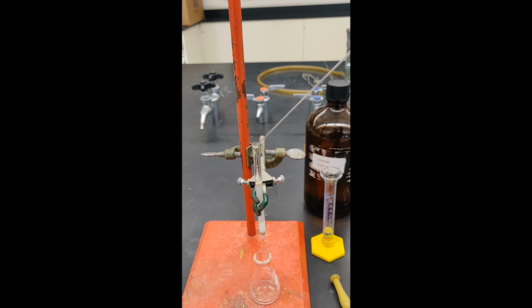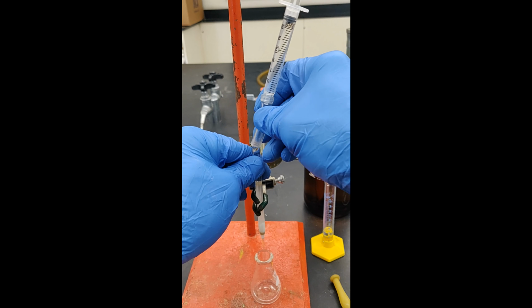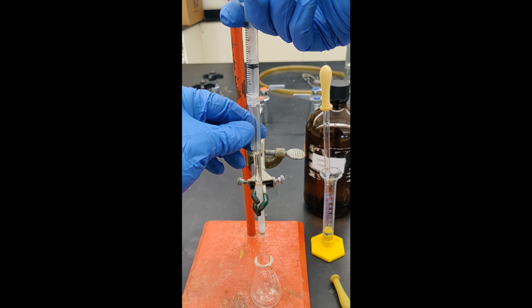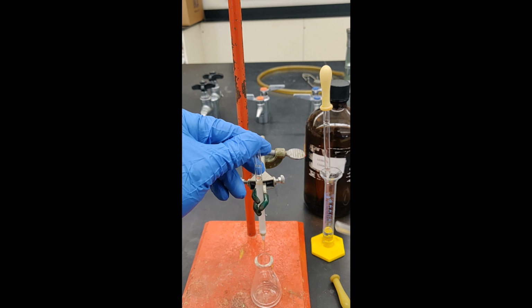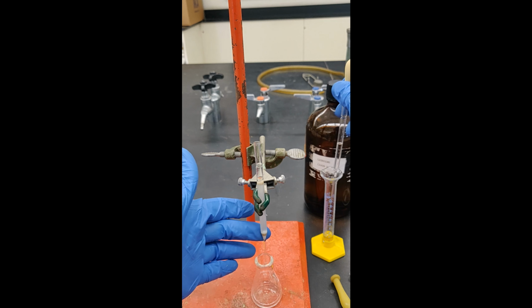Don't forget to remove the rubber bulb or air pressurization device from the column before refilling it with air. Otherwise, you'll suck the contents of the column up toward the syringe, thereby ruining your column. Repeat this process until all of the silica gel in the column is completely wet. You might have to do this 5 or 6 times in order to completely wet the column and have it packed tightly.